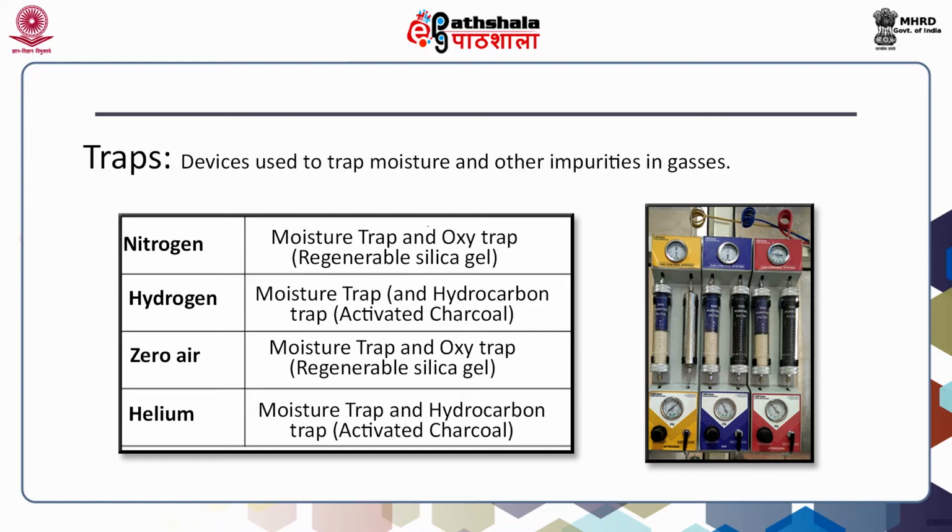So, once we make use of these traps, then we are doubly assured that the gas which is passing through the machine, that is the gas liquid chromatograph, is very pure and that will improve the efficiency of our analysis.